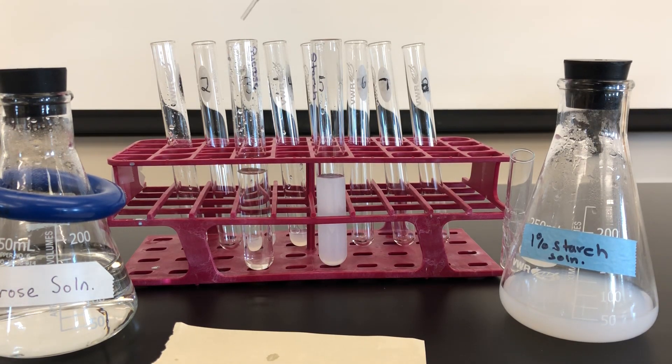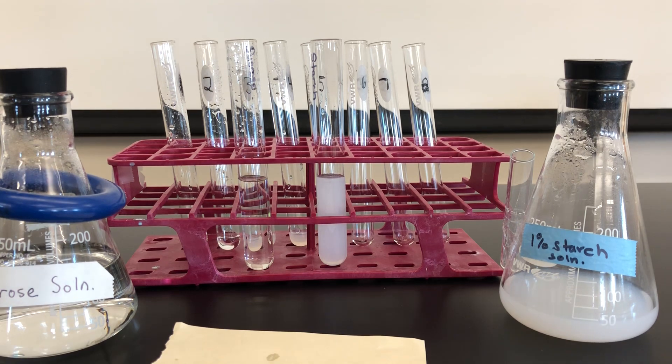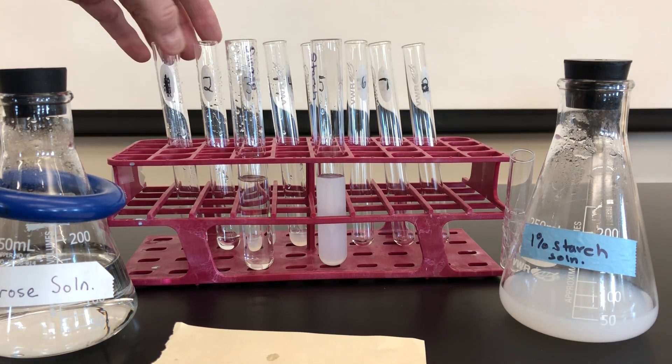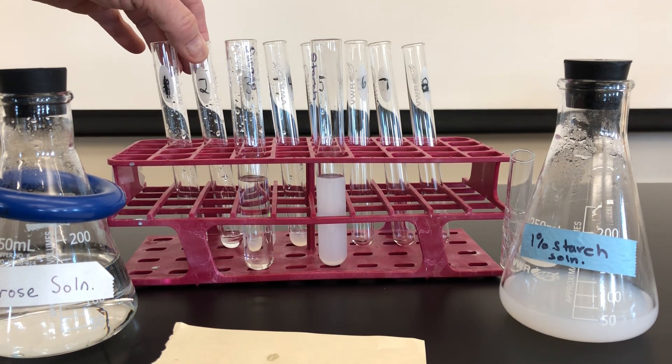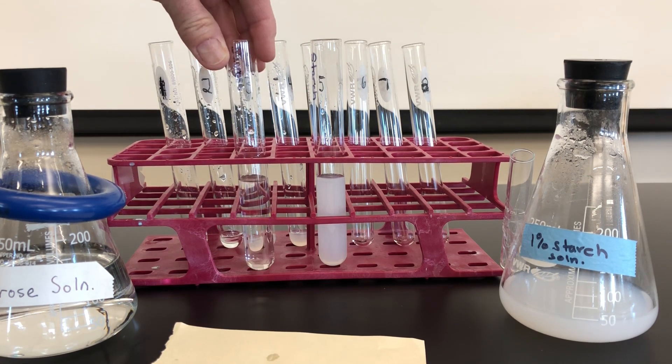After two to three minutes, I draw off another ml of the sucrose and place this into tube number two. So these first two tubes are time zero and two to three minutes in, to see if we have any hydrolysis of sucrose.